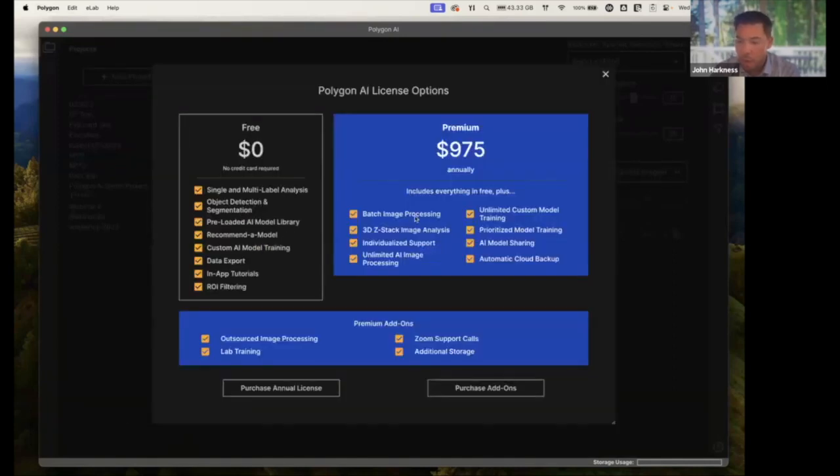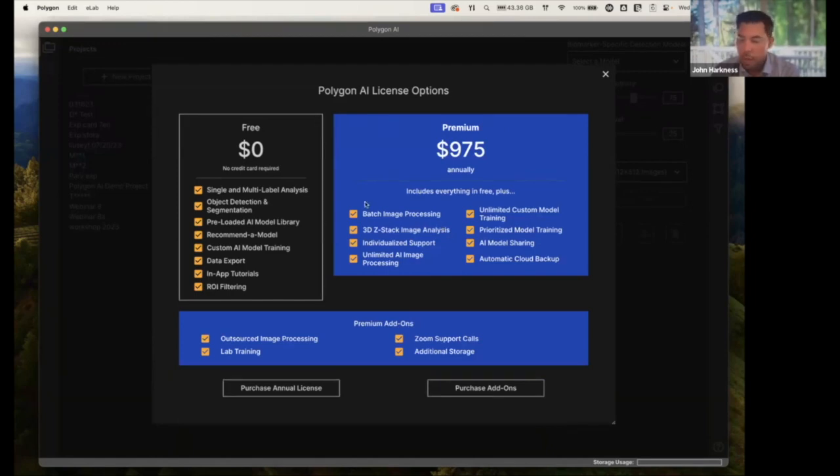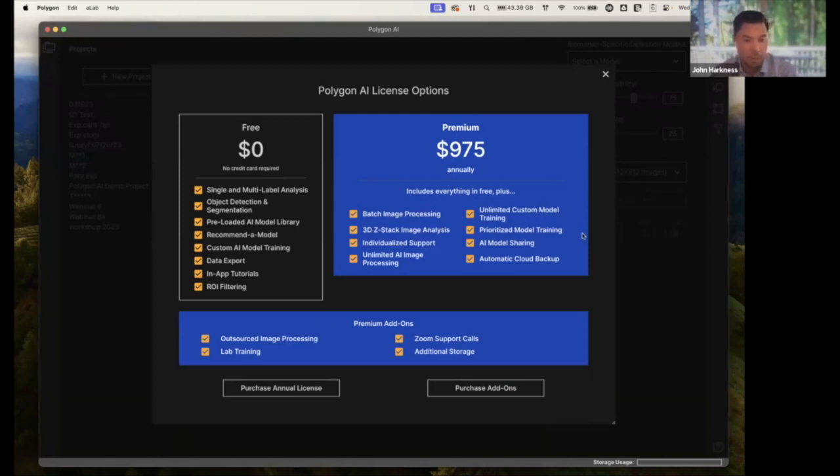And also hop in here and check out our premium features if these are things that are important to you. Probably what's most notable here is our batch image processing and the ability to train as many custom models as you would like.